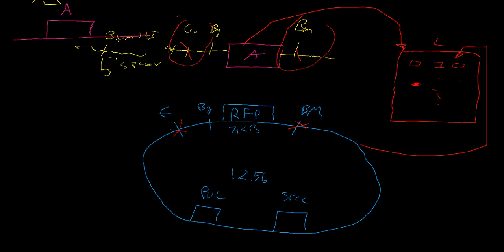is going to have two parts. We're going to have the vector backbone, if we're using the RFP, which is 1 kb. So we're not using that cool part. RFP is 1 kb. RFP is going to run down here, and our vector backbone, which is 2.5 kb, is going to run up here. So then we have this gel, we cut these fragments out, we can then gel purify them.